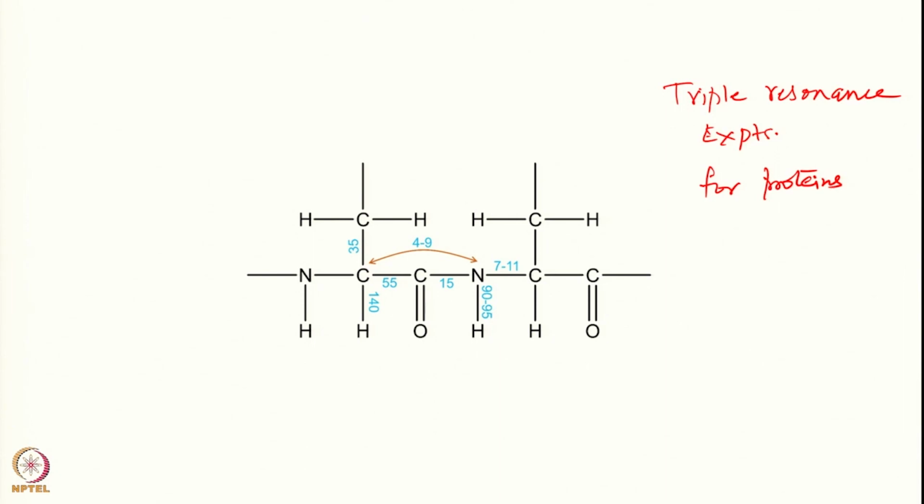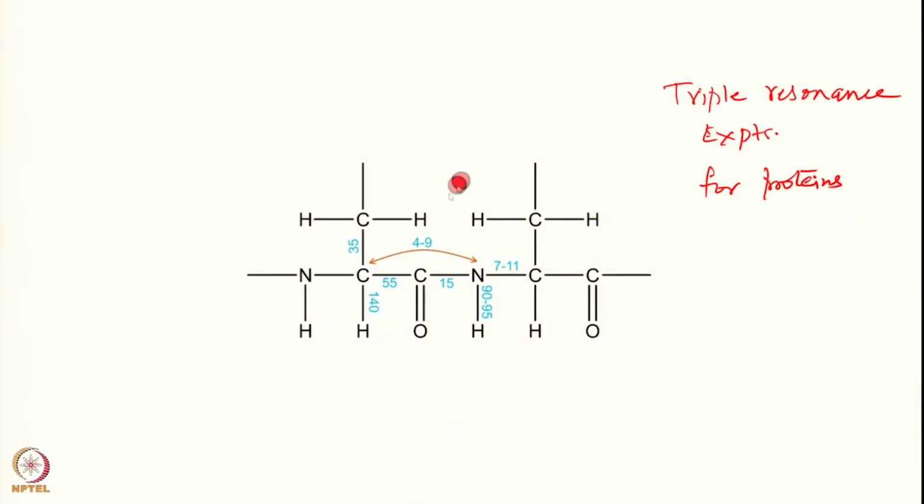Structural biology primarily, the application of NMR in structural biology, has primarily been driven by application to proteins. Also of course nucleic acids and other systems, but by and large methods development has occurred because of applications to proteins. So here I show this slide again to you, indicating the strategy.